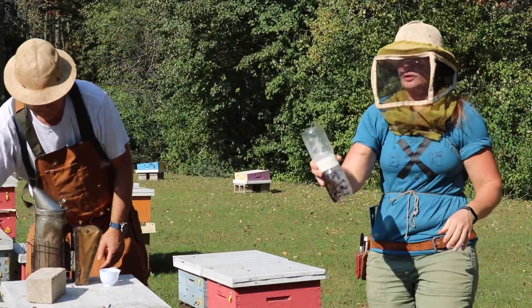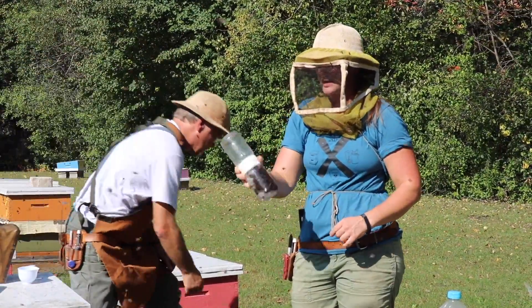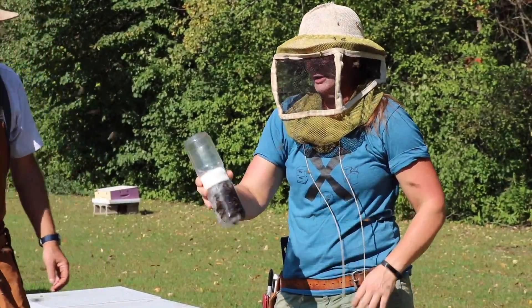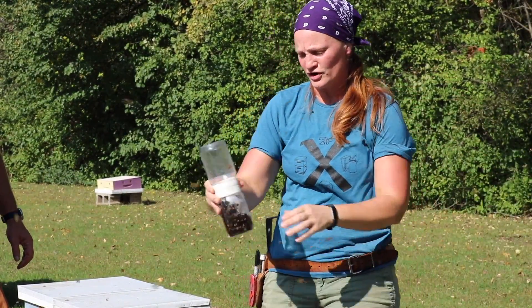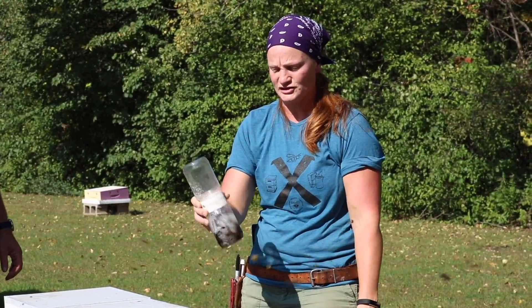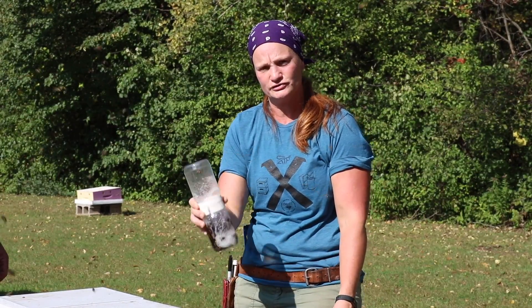We're going to use this handy device called the mite shaker or the bee shaker. That gives us an idea of how many mites are living within the bees inside this colony. You want to shake it for about a minute or two — that'll give it time to kill the mites as well as the bees, and that will separate them. The mites will no longer hold on with their little feet; they won't have the ability to do so.